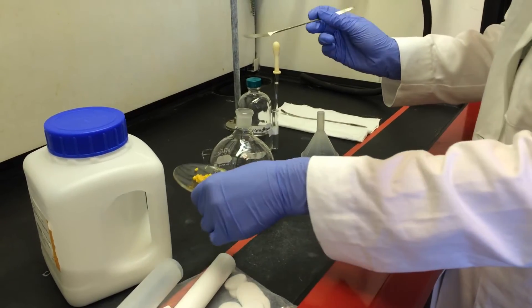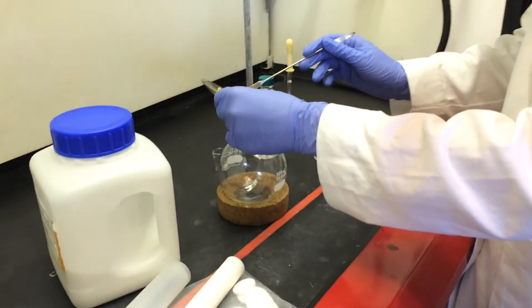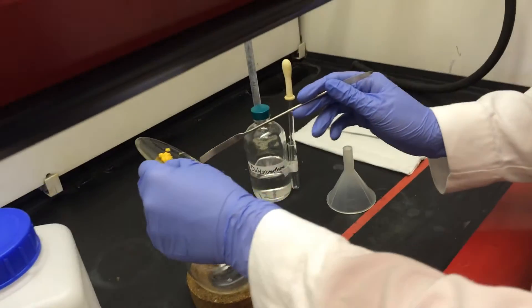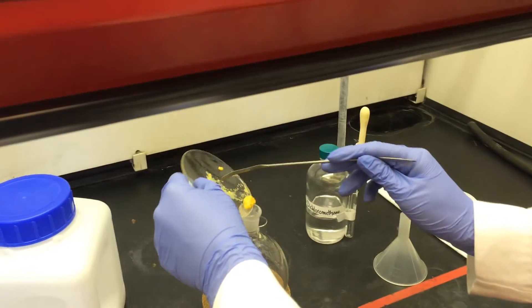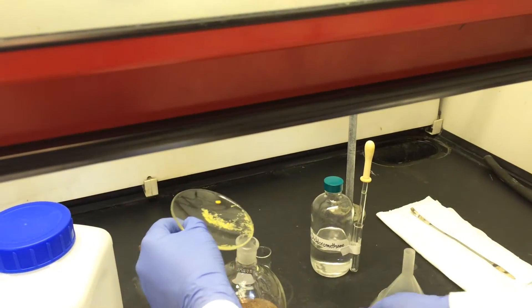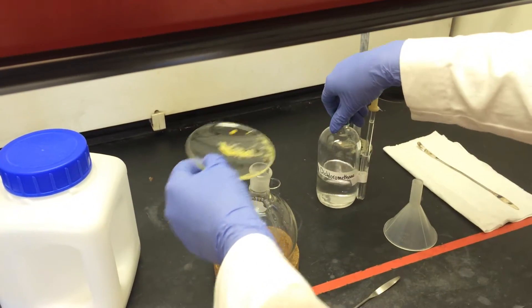Okay, so first you want to get your sample into a 500 milliliter round bottom flask and use dichloromethane to get off any excess.